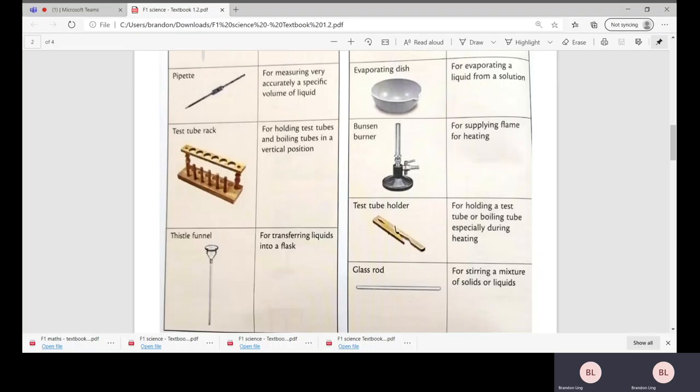For drying, or when you are running certain experiments and you want to take a look at the test tube maybe 10 or 15 minutes later on, you can actually put it on this test tube rack. Next we have the Bunsen burner used for heating, and test tube holder used for holding a test tube.